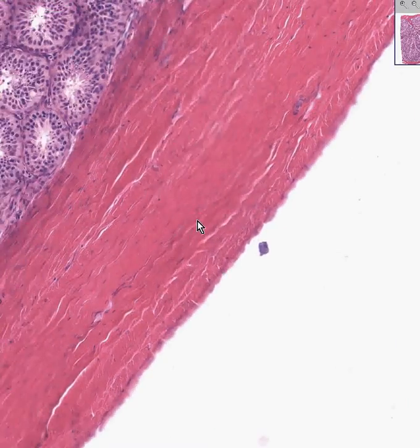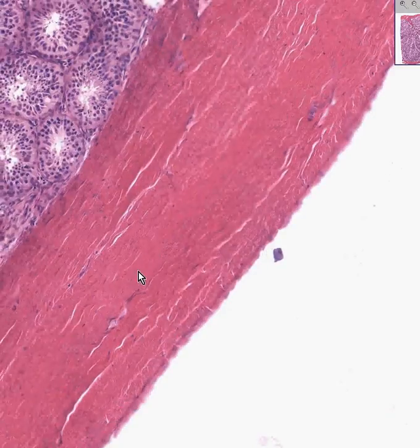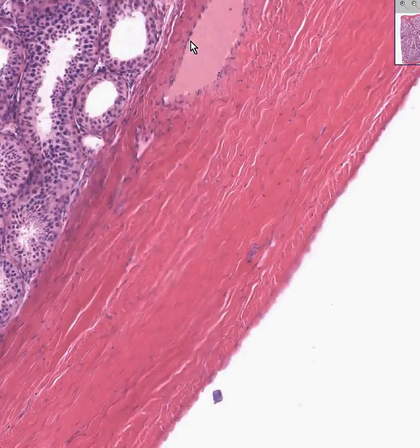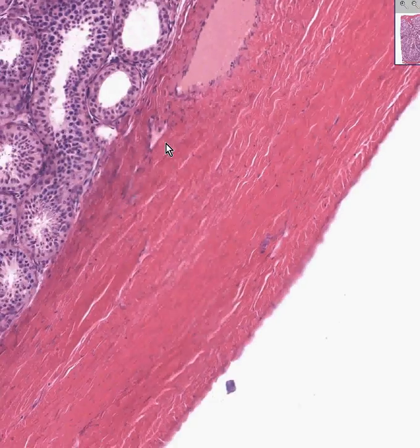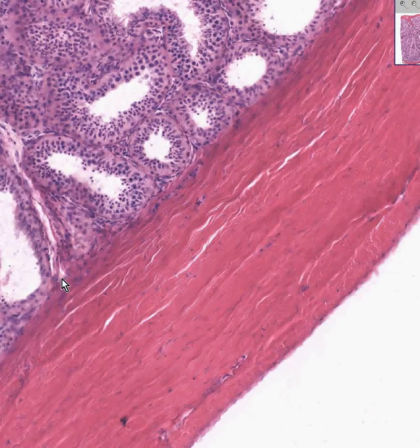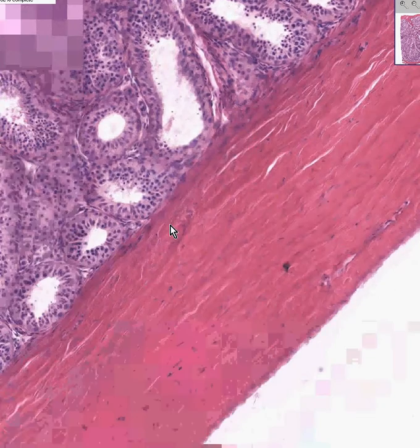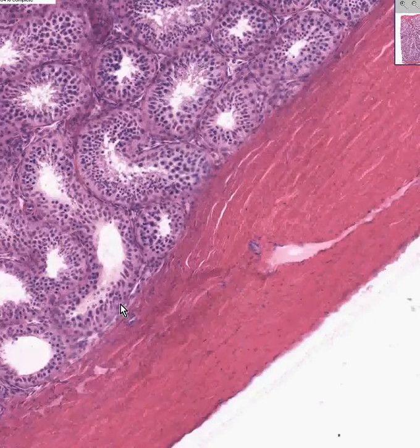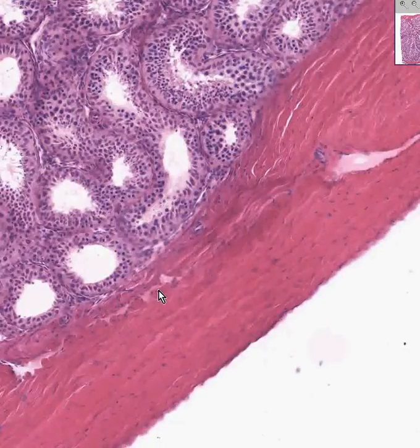The chief thickness of the testicle capsule is the tunica albuginea, and as you can see, this is chiefly just fibrous tissue, collagen, and fibroblasts. Theoretically, there's another layer before you get into the seminiferous tubules, which has a lot of blood vessels, like here and here. It's the deepest part of the tunica albuginea, which is called the tunica vasculosa. You can see some vessels here. And it's not as well defined as the other tunics, but nevertheless, when you go into the very deepest parts of the tunica albuginea, you'll see blood vessels, and that's called the tunica vasculosa. So much for the capsule.